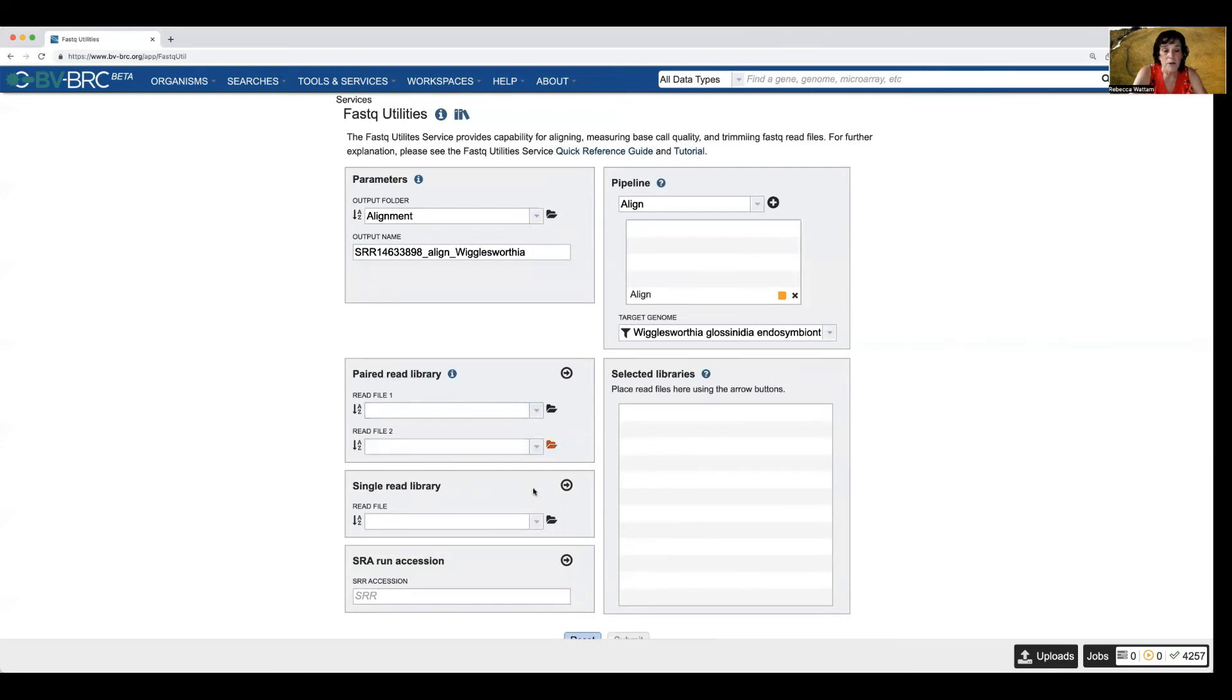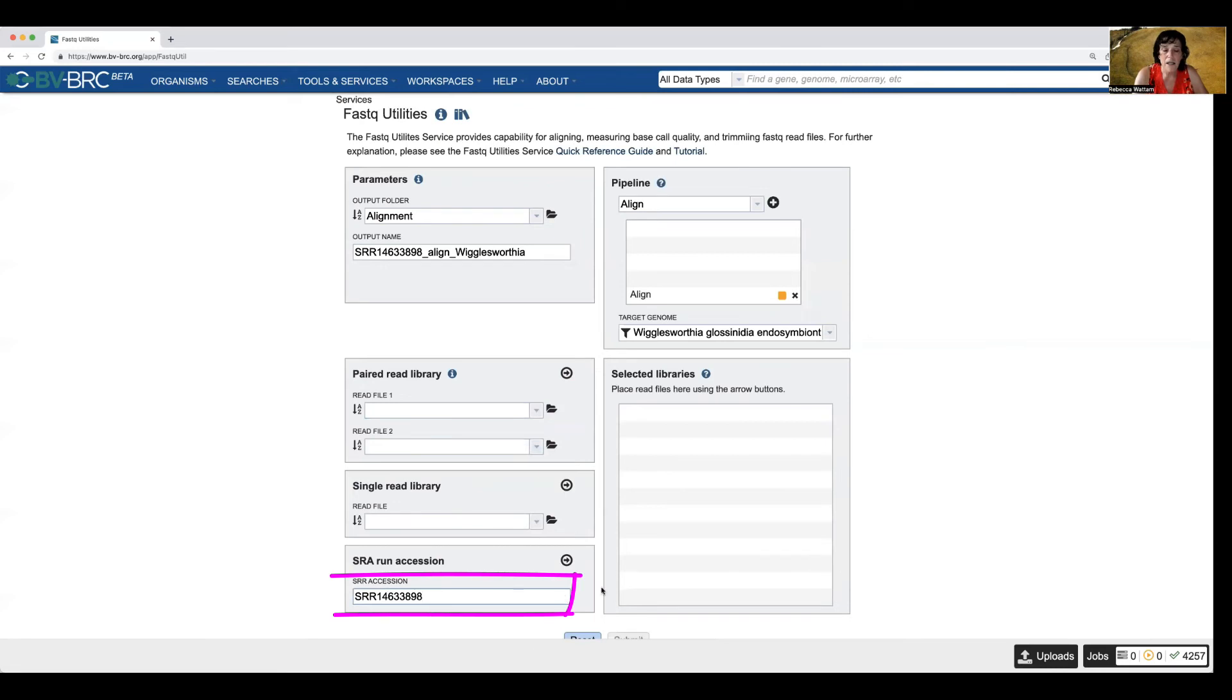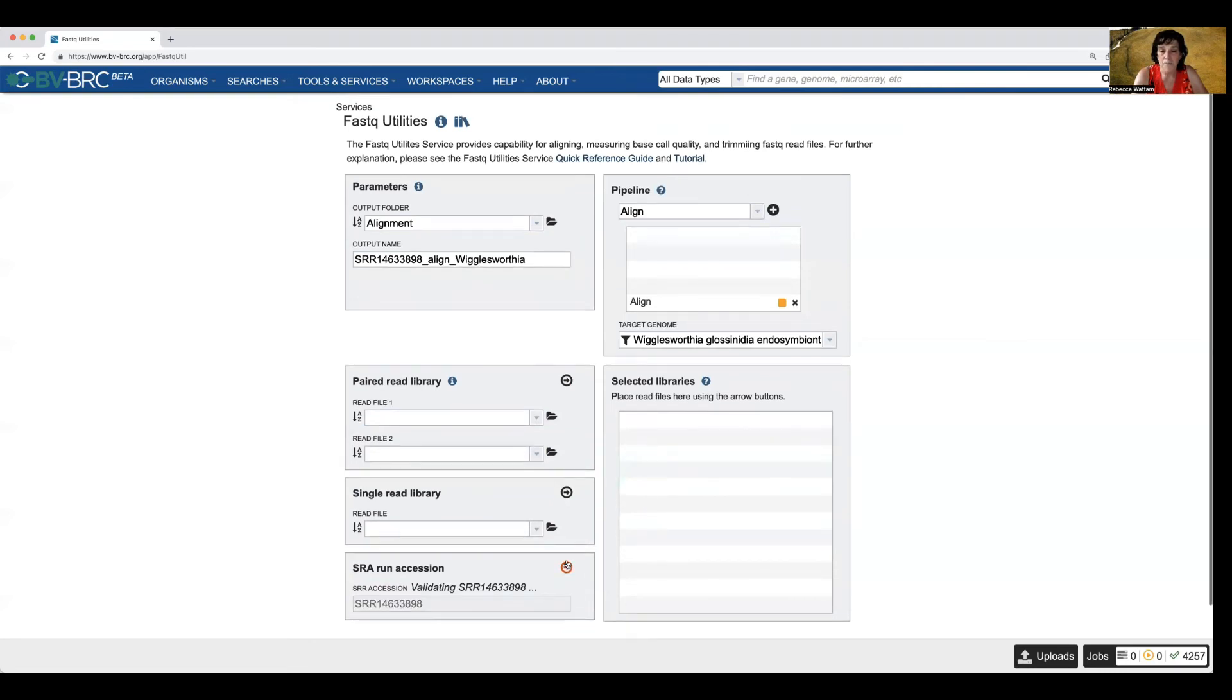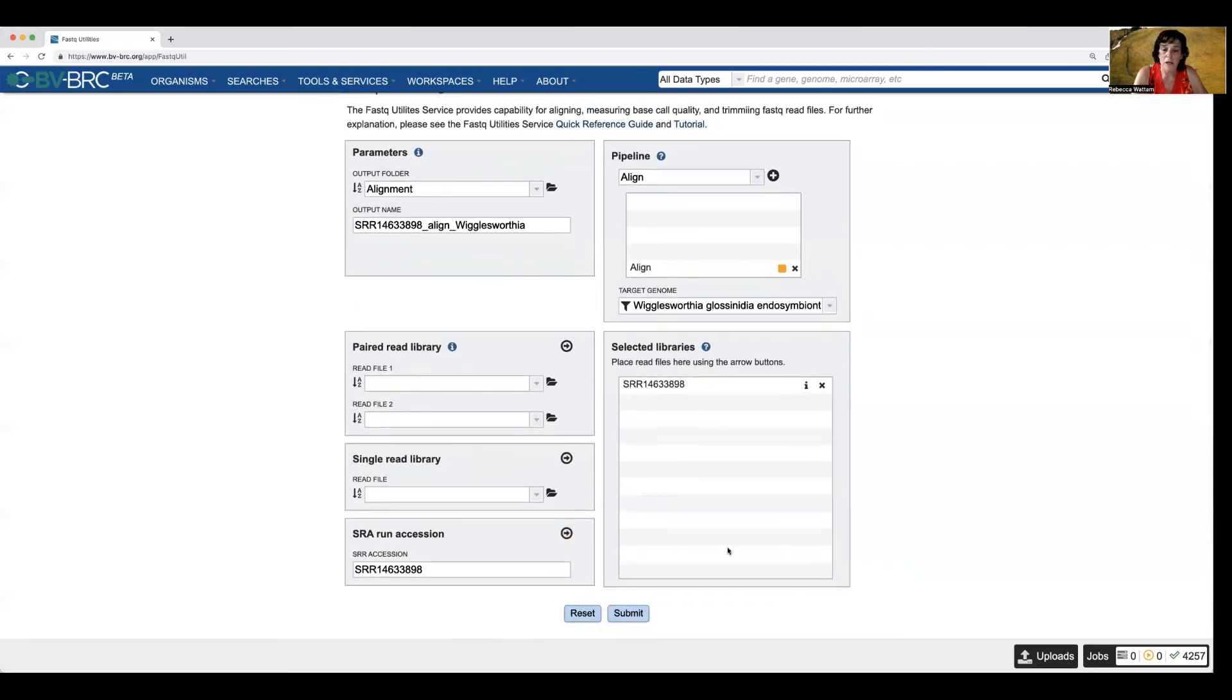So you could do paired or single reads, but for this one, let's just use the accession number. And how great is this, right? We could get reads directly from the sequence read archive. They're all public. They're all there for you to analyze so that you can compare different data with yours. And this is the accession number and I have to move it over into the selected libraries box. So I click on this arrow here. And you notice there was a brief message that said it's validating it, making sure that this is an actual SRR number.